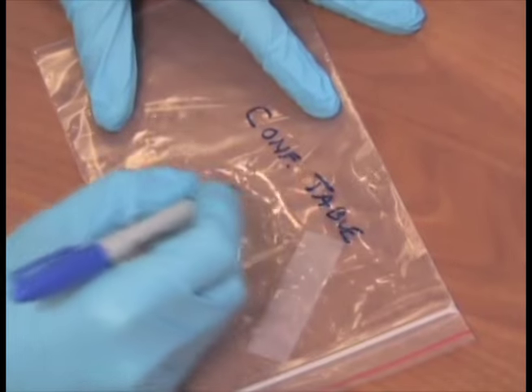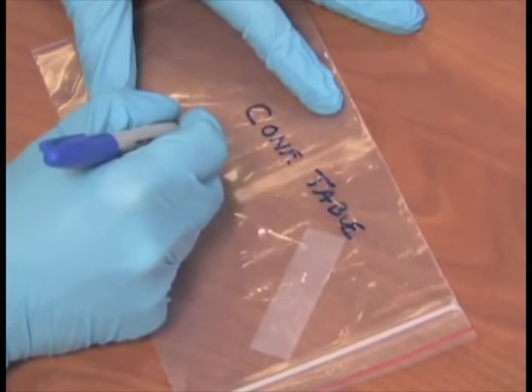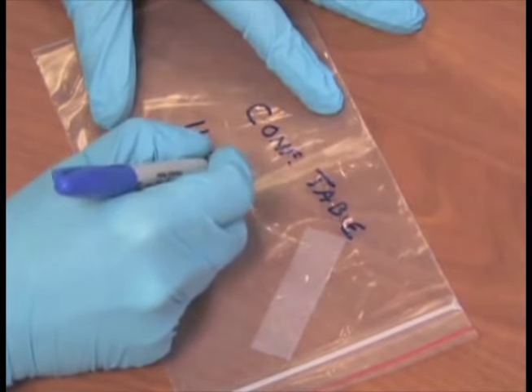Tape samples can be analyzed only by direct microscopy. No viable analysis can be completed on a tape sample.